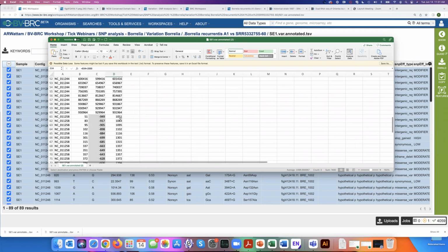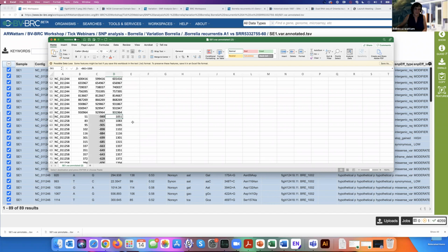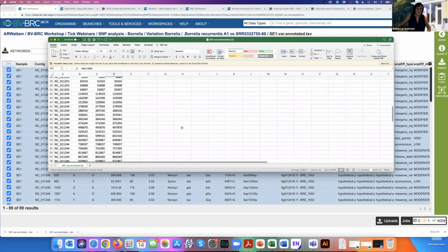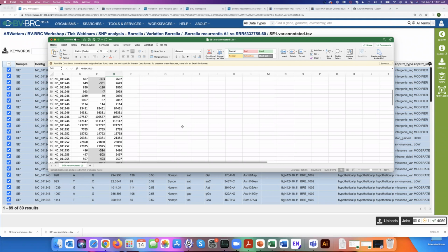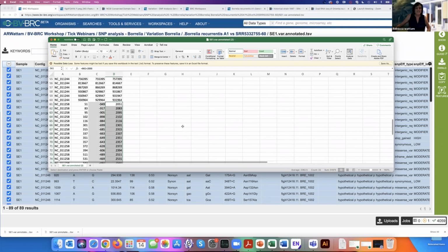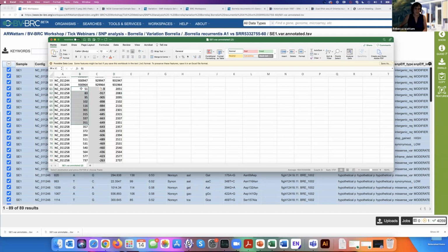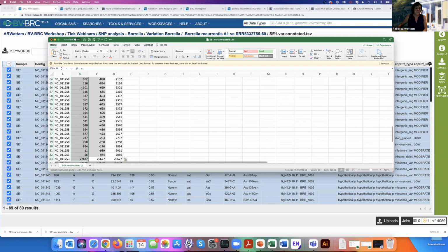Okay. And then here I'm just doing this to... But in theory, you could just use the exact location. Yeah, but then you have to zoom in. Well, no, you can't zoom in in the viewer. This is just to create a figure for a publication. If you want to see exactly where it is in the genome, that's what the genome browser is for. So that's the drilled in view.